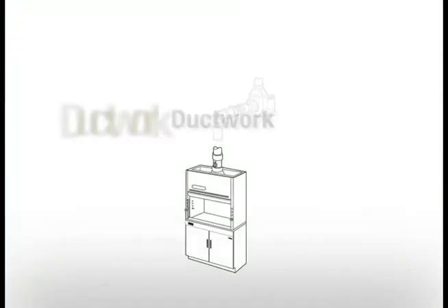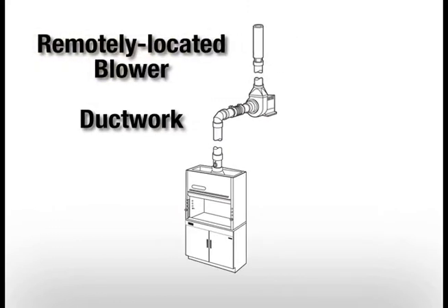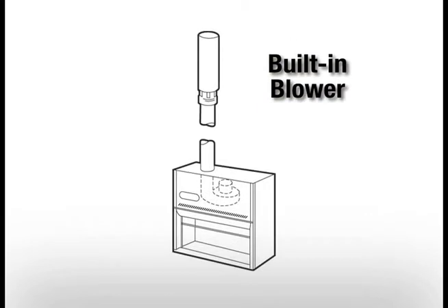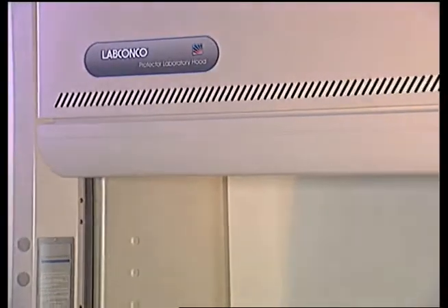As with any hood installation, ductwork leading from the hood to the outside and a blower — either remotely located or built into the hood — are required. Ductwork and blower installation is not shown in this video.